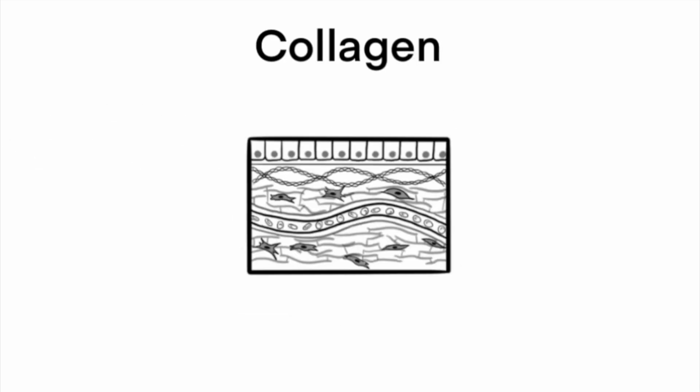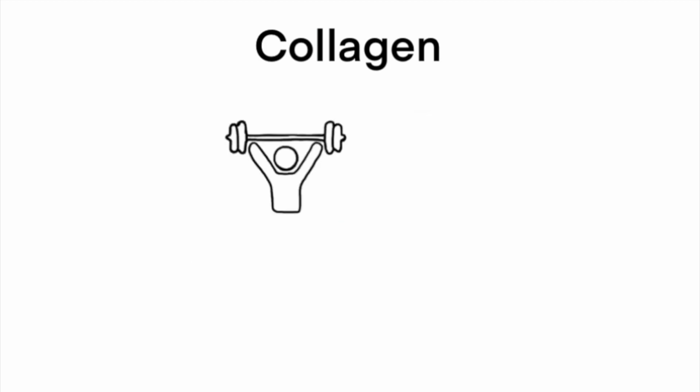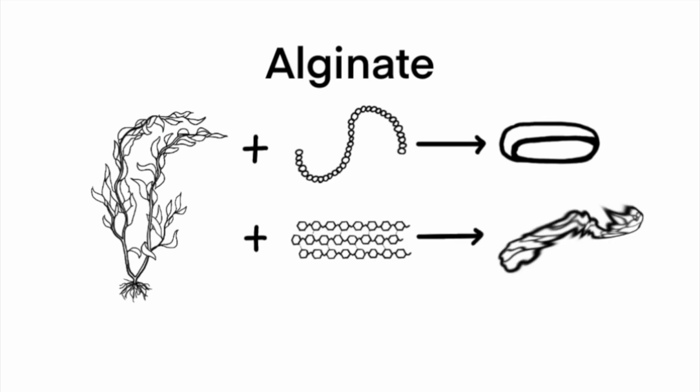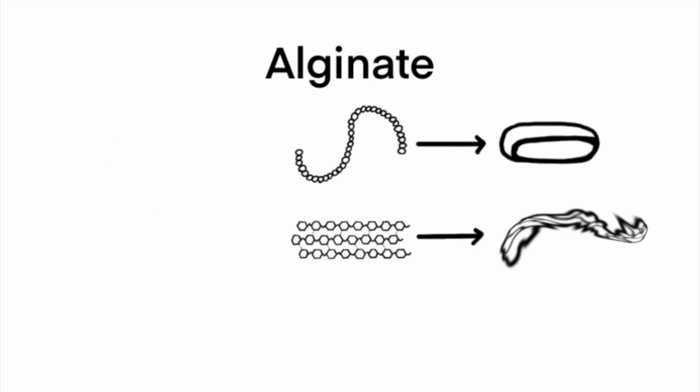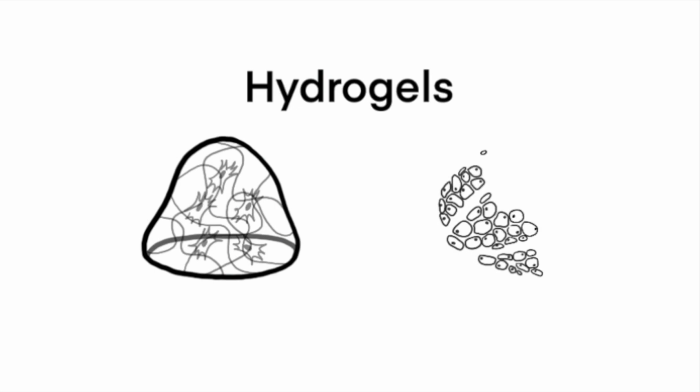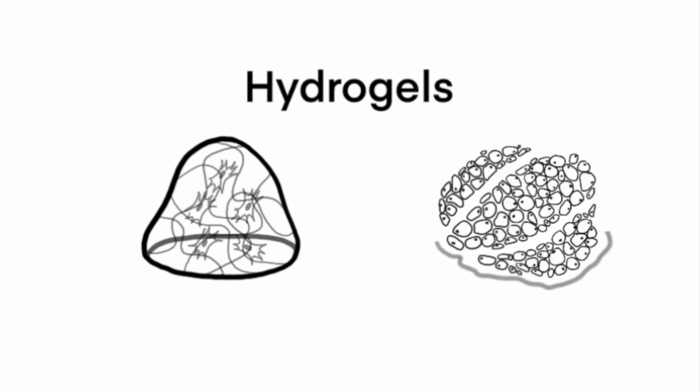Different bioinks in isolation or combination are better suited for printing tissues with certain properties. For example, collagen is a primary component of the extracellular matrix. This makes it a good choice for printing high-power tissues like cardiac muscle. Contrastingly, alginate is a much softer bioink. However, with the addition of gelatin, it can be used to print scaffolds for tough tissues. Or, using a combination of alginate and methylcellulose will result in high shape fidelity, which could allow for modification of tissues post-printing. Hydrogels are clusters of polymer chains that can mimic the microenvironment of tissues in vitro, which increases cell viability and promotes tissue generation within bioprinted constructs.